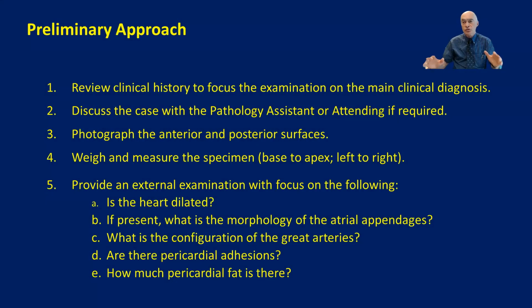First, we're going to review some very general aspects to be considered. Remember, we are physicians, not image diagnosticians, and we also always have to have the examination of any specimen in the context of the clinical diagnosis and also the imaging information in case that we have it at hand. So all these together are going to help us to assess the organ that we are going to examine.